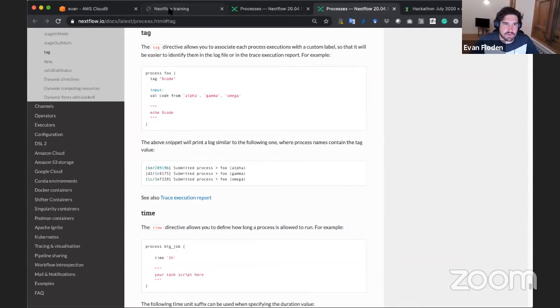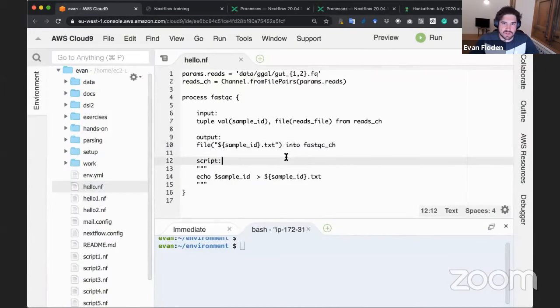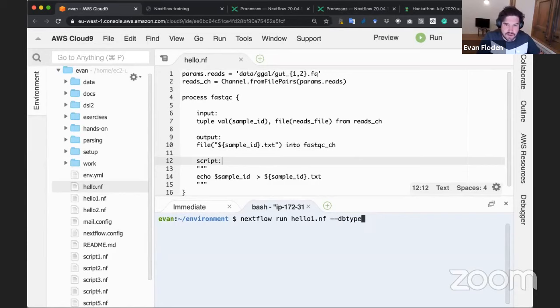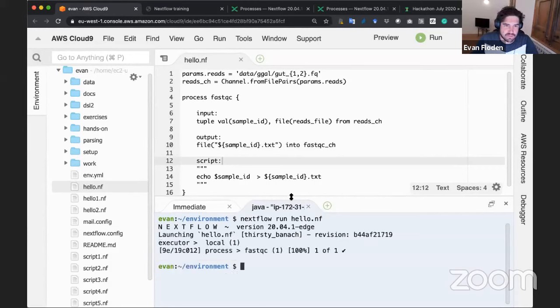So let's go back to our example that we had before. Just check that this is working here. Close this one, and then let's just run hello.nf. And now we want to add a directive to this process that we've defined here. So there was a question yesterday about what this one means here. This one after the process name is just the task identifier of that process. If you don't place a tag, it's just sequential. So 1, 2, 3 as the tasks are executed.